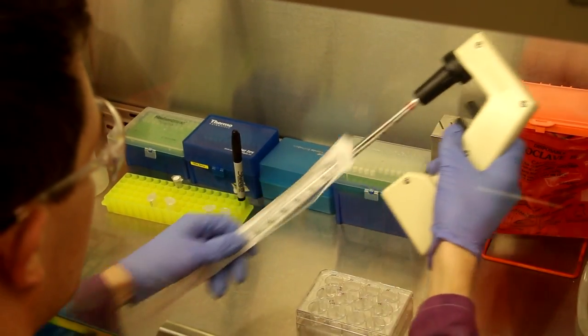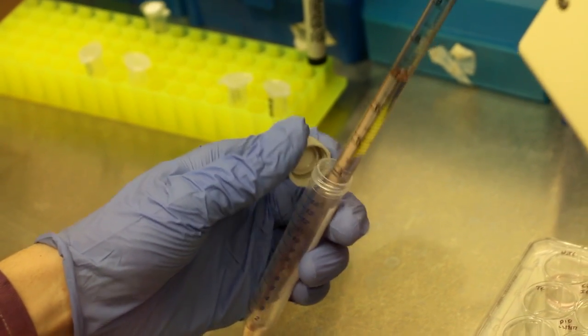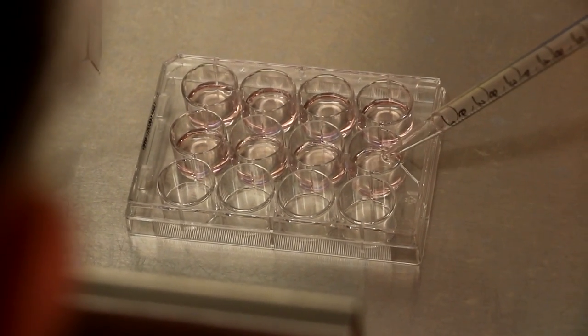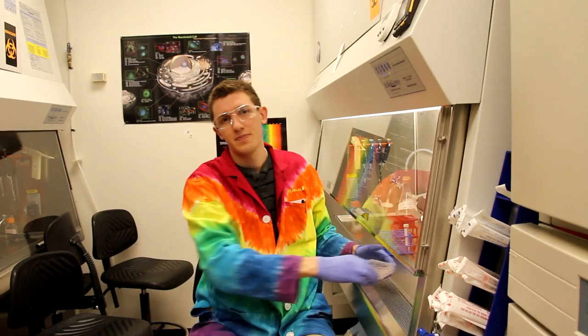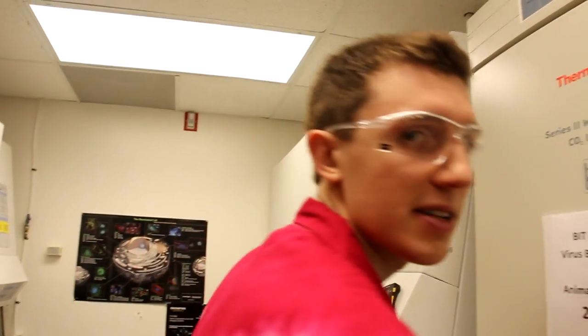You will now add 1 ml of your transfection reaction mixed with growth media to each well in your 12-well plate that you intend to transfect. When you're finished with transfection, return your cells to an incubator set to 37 degrees Celsius.